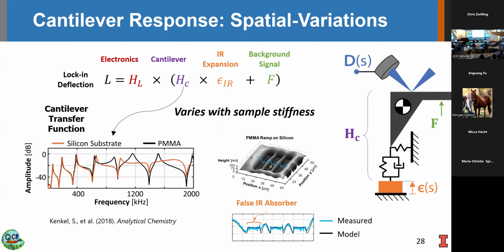This can drastically change depending on which frequency you decide to choose, and we will demonstrate that later. And in general, it is not something that can be predicted for any general sample, which is not the case for this engineered polymer sample.